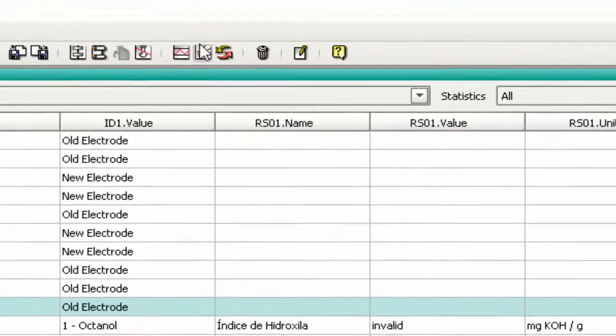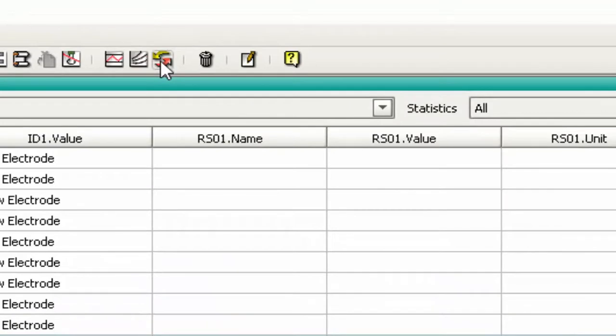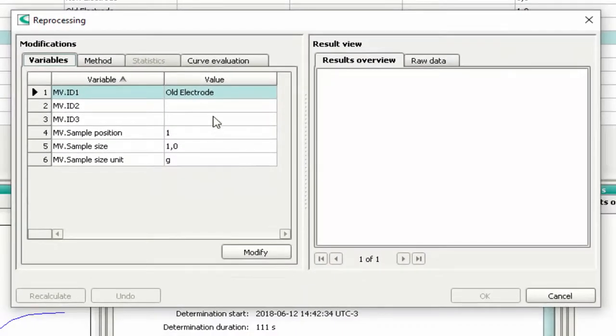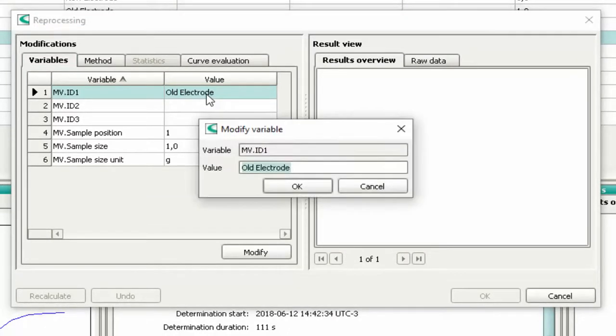Press the button 'Reprocess selected determination'. To correct some typing error, just double-click on the incorrect information. In the next window, enter the correct value and press OK.